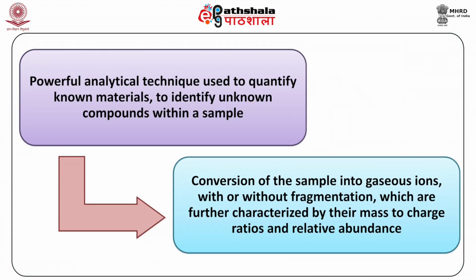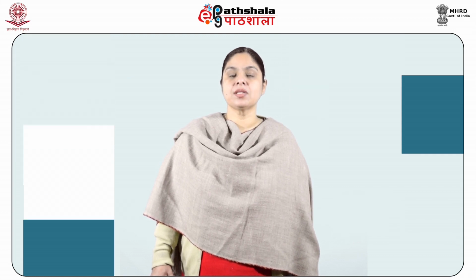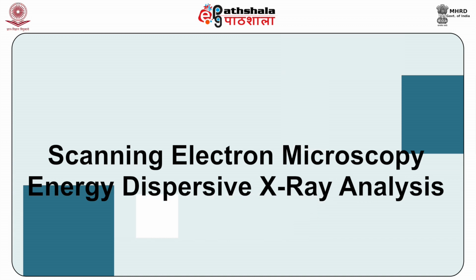Now, mass spectrometry is a very famous and powerful analytical technique used to quantify known materials and to identify unknown compounds within a sample. The complete process involves the conversion of the sample into gaseous ions with or without fragmentation, which are further characterized by their mass to charge ratios and relative abundance. The applicability of this technique depends on the paint type, layer complexity, and the amount of sample consumption that can be tolerated.